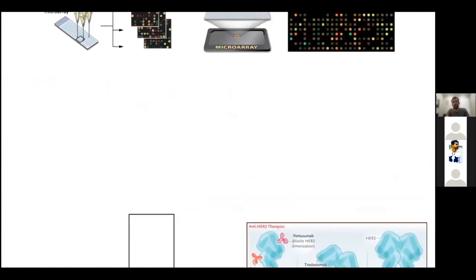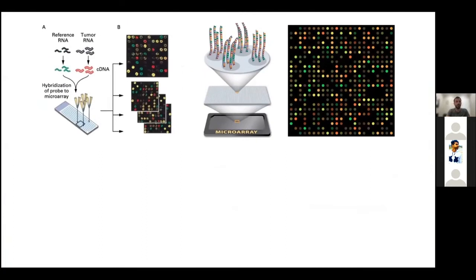Many methods of RNA sequencing come from the microarray data analysis technique. So before next generation sequencing became an easy and accessible data type, there was first generation sequencing. And first generation sequencing really refers to sequencing using Sanger sequencing, where we have to annotate the whole genome and select specific regions to sequence. And it's a fairly complicated, labor-intensive and expensive process.